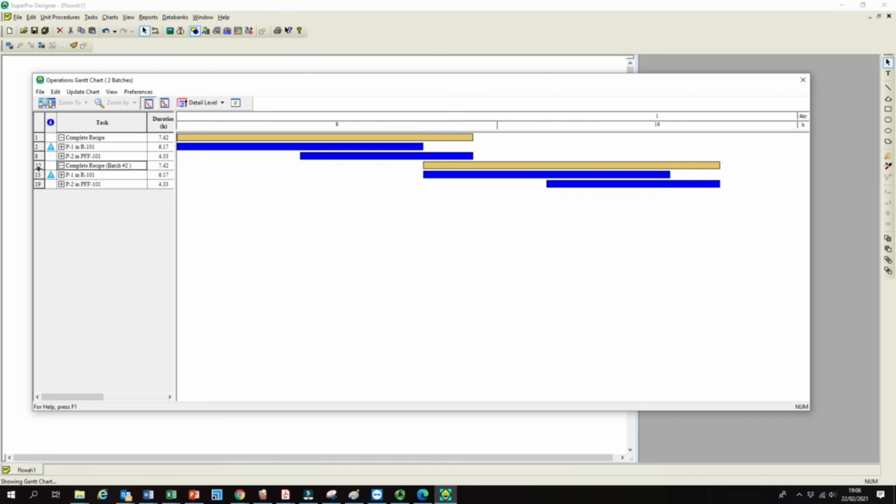And it also gives some very good idea, like what you look here, exactly at this point.